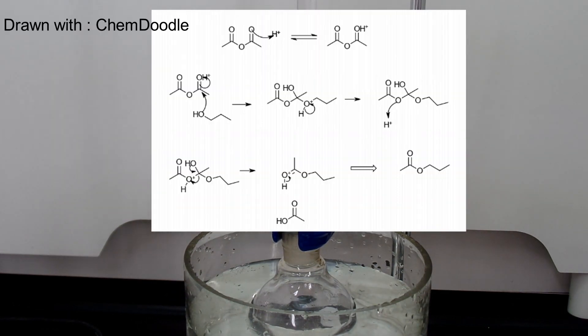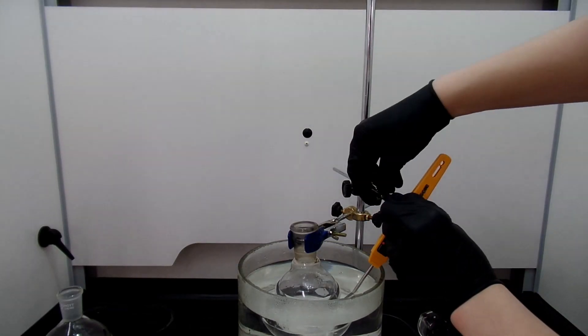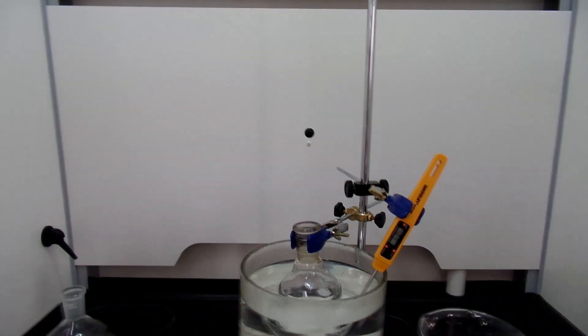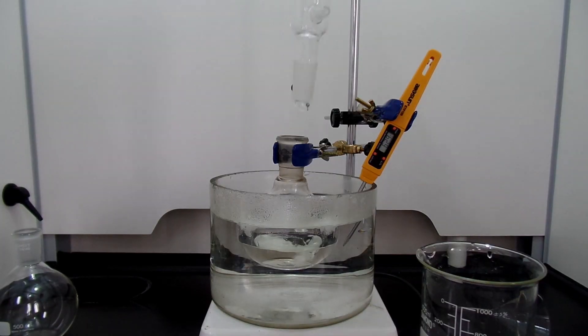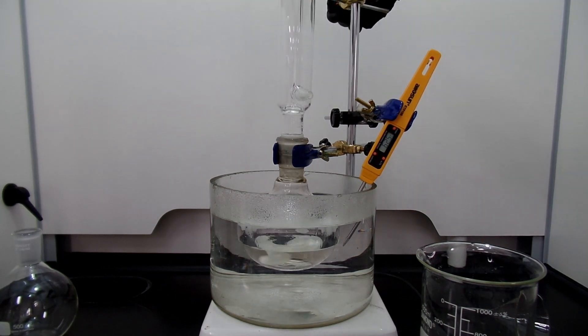The reaction is shown above. The carbonyl carbon in acetic anhydride is attacked by the oxygen on the alcohol. Then this reaction proceeds and finally you get the ester, forming N-propyl acetate. After all the addition, take the ice bath out and change it to a warm water bath. I just use hot water from an electric kettle and let the mixture sit at 70 degrees Celsius for 10 minutes. I attach a condenser without water running to prevent water from going into the reaction flask.